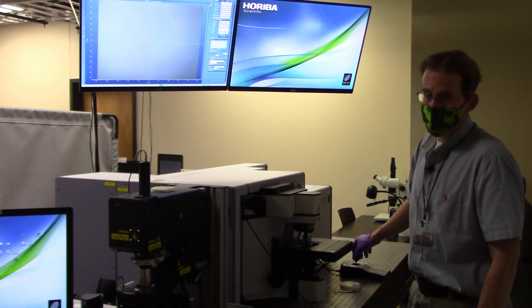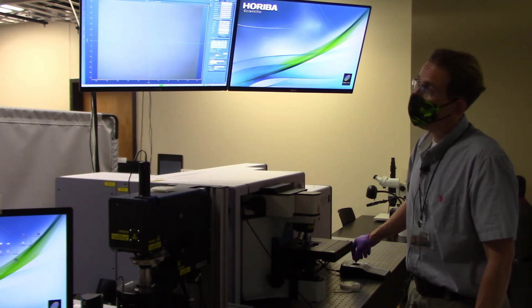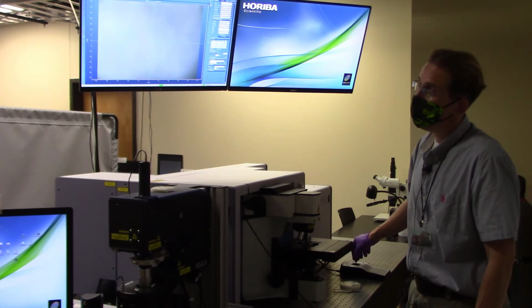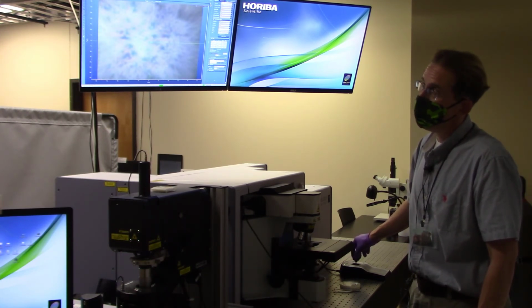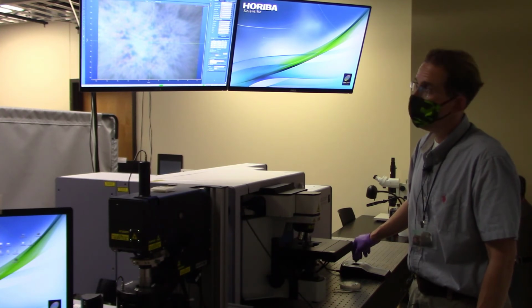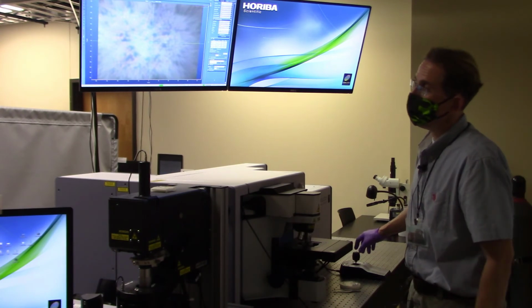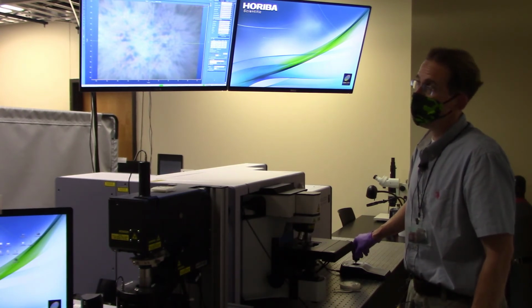And again, if I had made a mistake and gone a little too far, it doesn't take long before you see that diffuse light start spreading apart, and then boom, there's that weird looking image, kind of staring at a bunch of wasp eggs. Again, that's the fiber optic bundle right here. That's why it's moving around when I play with it. So if you ever see that, remember you've got to go back down.